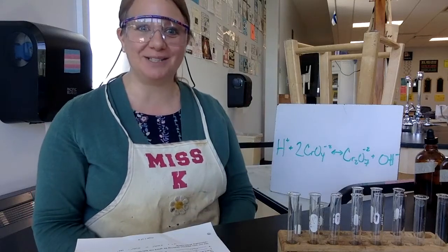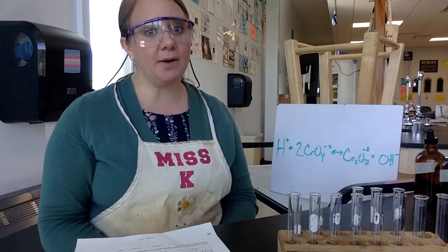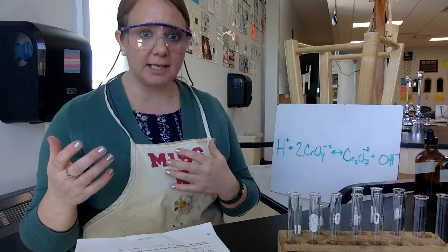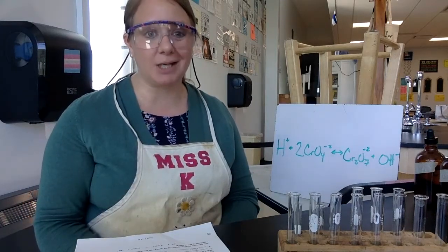Hello and welcome to your very last pre-AP chemistry lab. Thank you for those of you that joined in to do this optional lab. Again, the reason I wanted to do this is because this concept of Le Chatelier's principle and chemical equilibrium is actually really useful in lots of high-level chemistry courses and topics. So I want to make sure you have this opportunity for those of you that are interested.